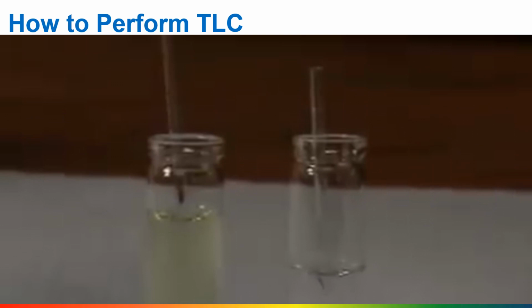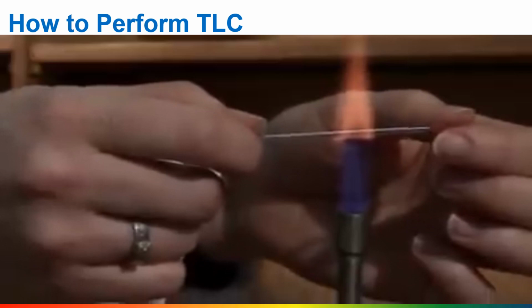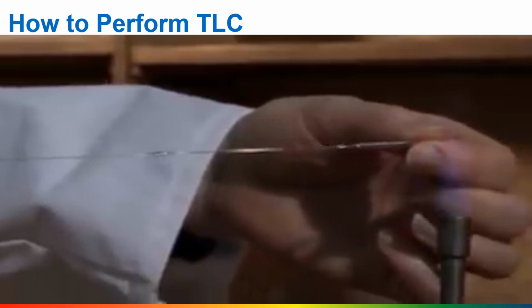First of all, we need to make a TLC spotter. Heat the centre of a capillary tube in the blue cone of a micro Bunsen burner flame. Rotate the tube gently to ensure it's heated evenly, and when it starts to give, take the tube out of the flame, leave it for a split second, and then sharply pull out both ends of the capillary to form a very fine tube. Allow this to cool, and then snap the tube to produce two spotters.